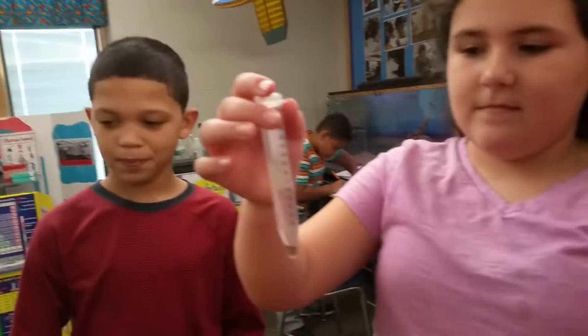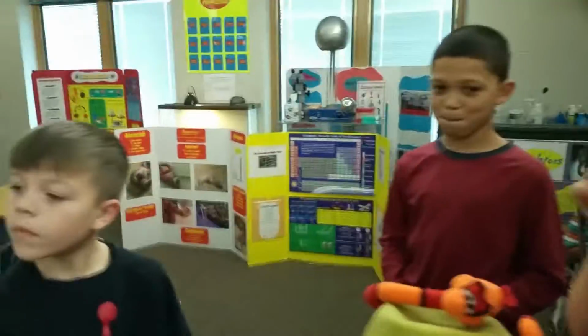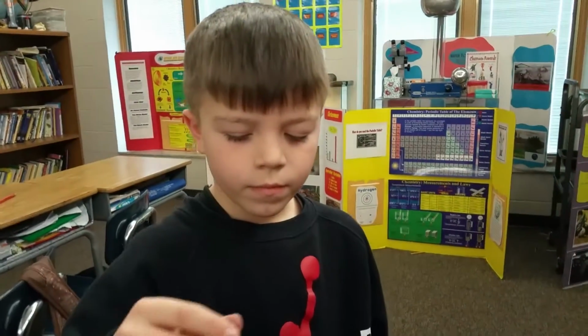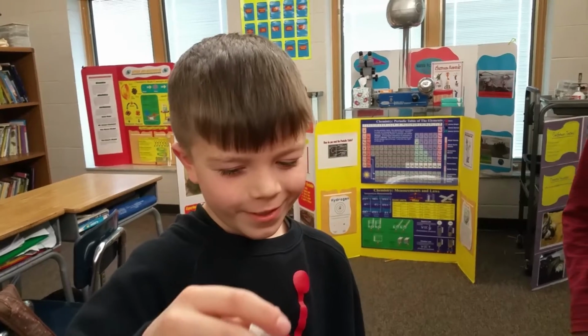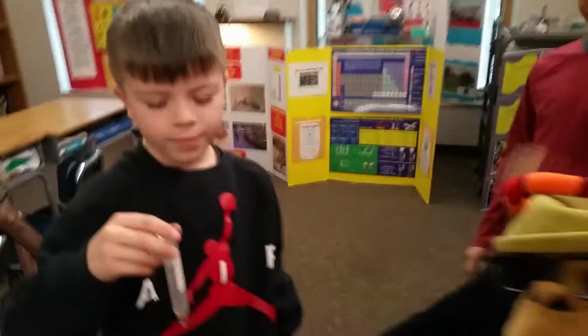Look at Hannah's. Good. Look at Dora's. Look at the scenes. Good. Looks like the centrifuge separated the sediment, the sand, from the suspension. All the sand is on the bottom. And Tyler, why is it on the bottom? Which is denser, water or sand? The sand is denser. Good.